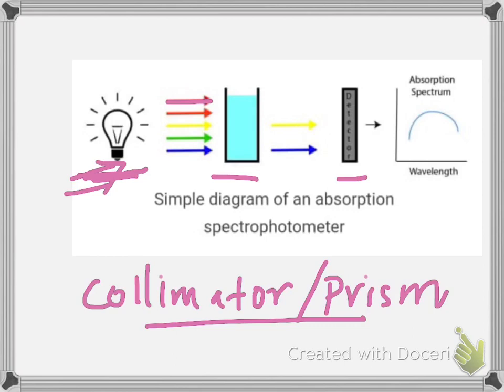A cuvette is used as the sample holder. This is a specialized piece of glassware with a very precise width and material. The material of the sample holder is very important.